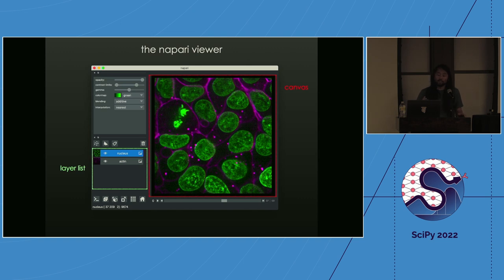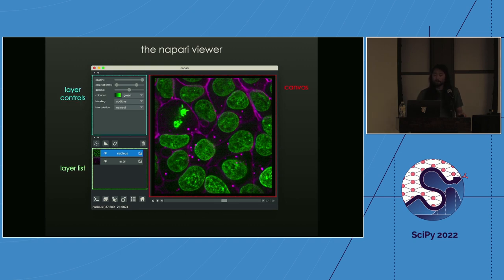We have a concept called layers, where typically each dataset gets its own layer. The layer list is where you can see and select how those are currently being viewed — clicking the eye icon turns a layer on and off, and you can reorder how they're visualized in the canvas. Each layer has a set of controls to choose how it's rendered, such as opacity, contrast limits, and blending with adjacent layers.